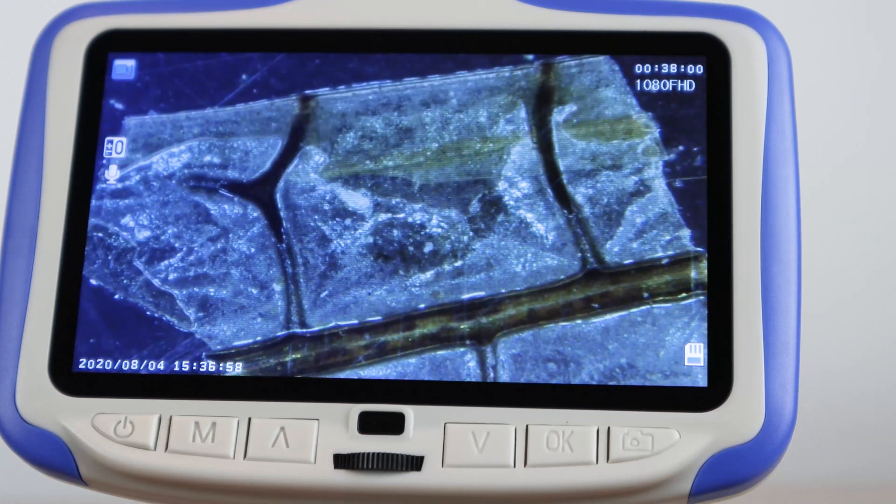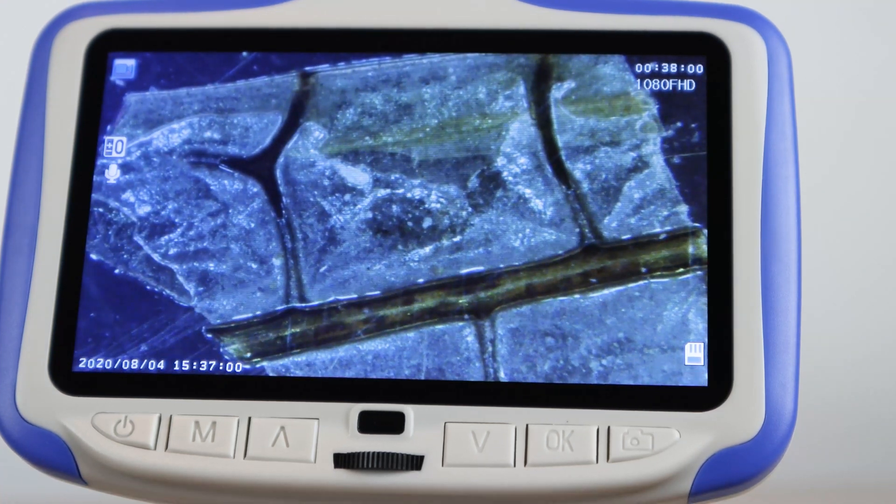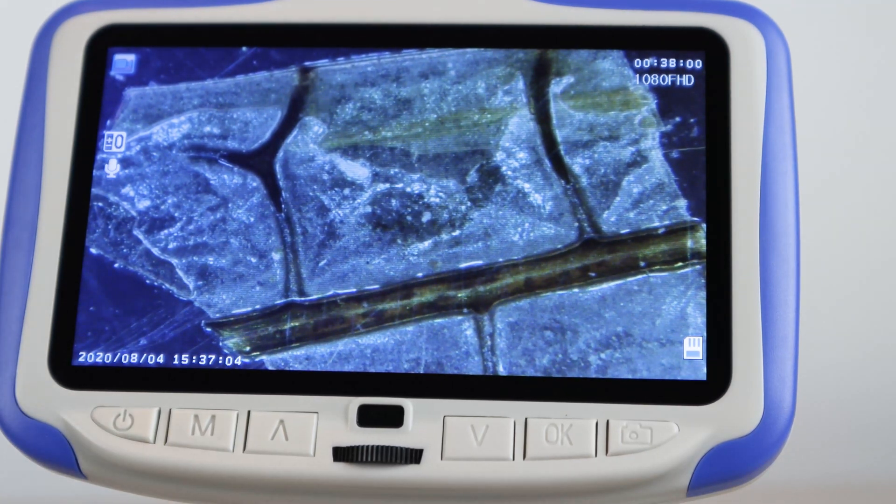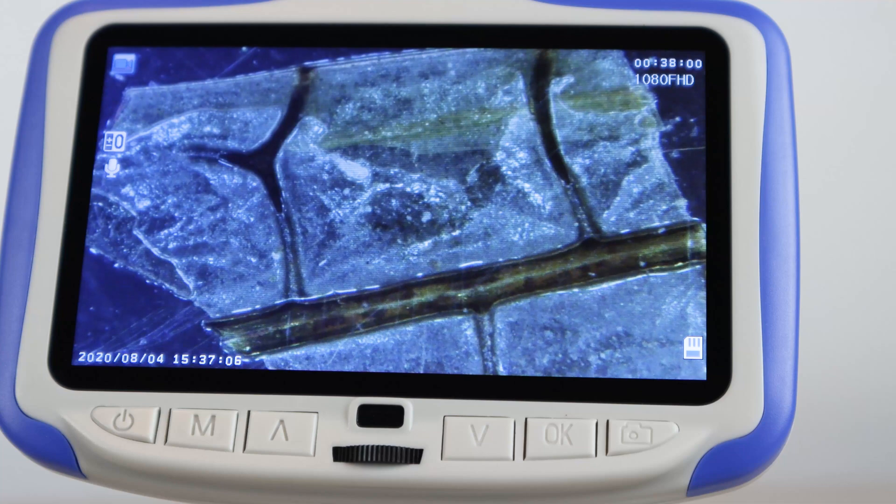And finally, with the black disk, we can see the contrast of the sample versus the dark background, which gives us a better view of some of the definition and detail of the sample.